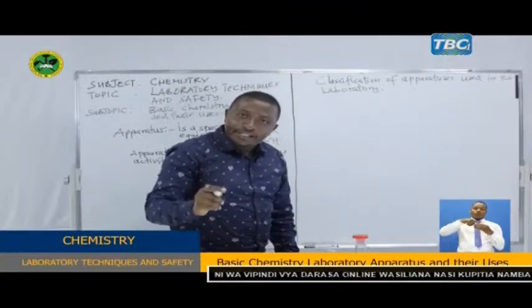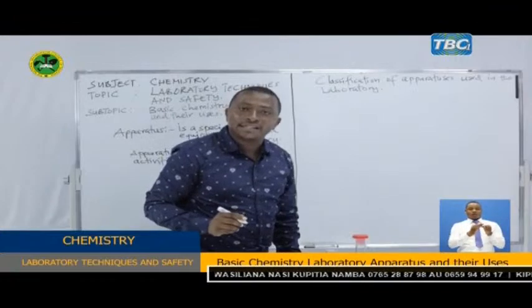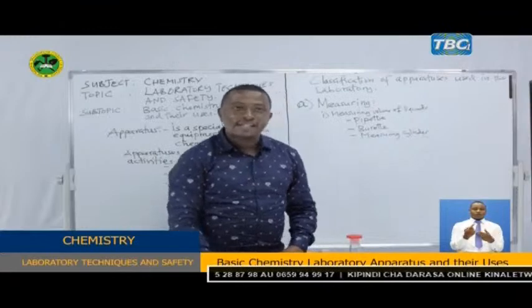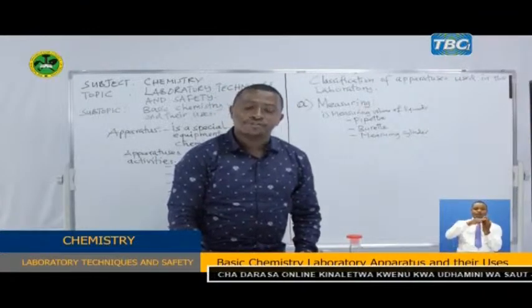Apparatuses used in the laboratory, dear student, are categorized into apparatuses for measuring. Now student, let us see these apparatuses for measuring volumes of liquids.